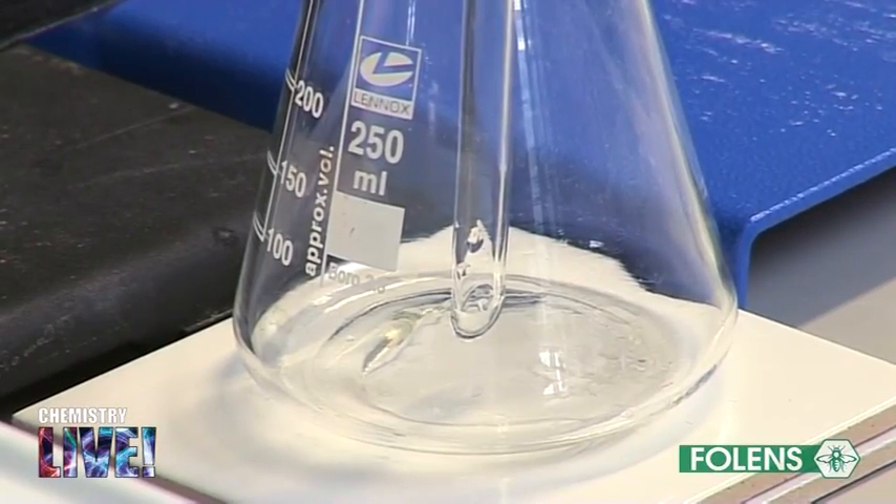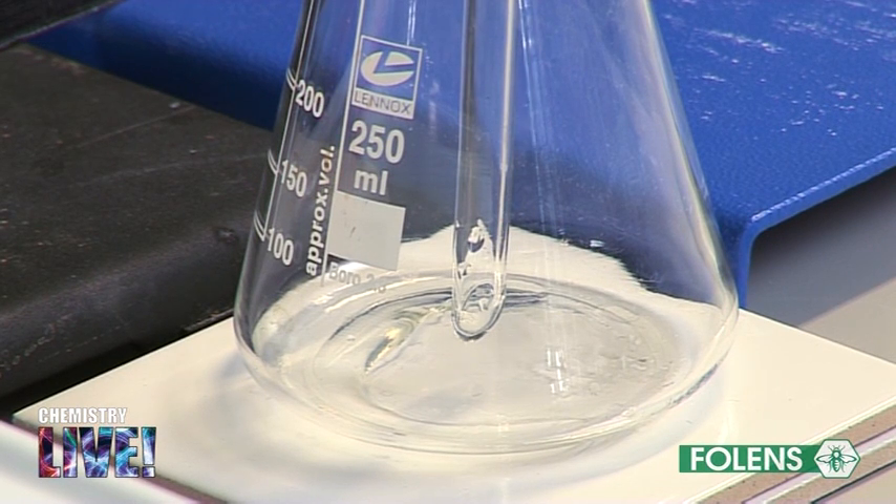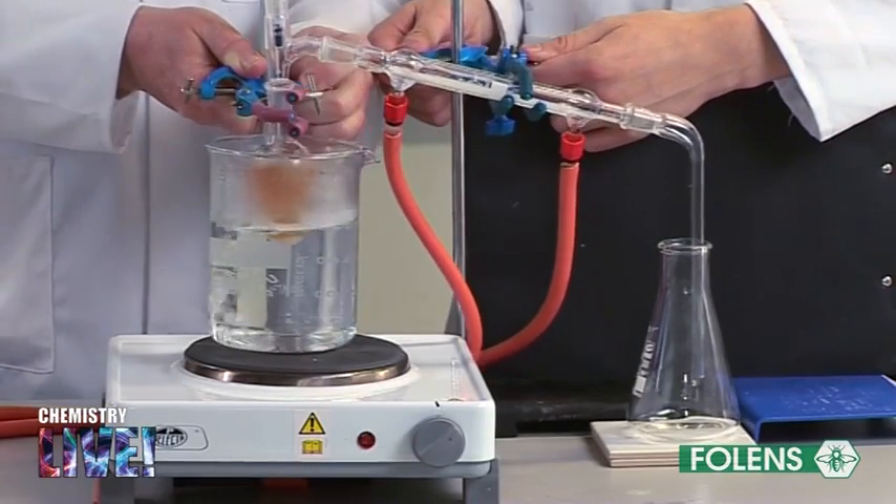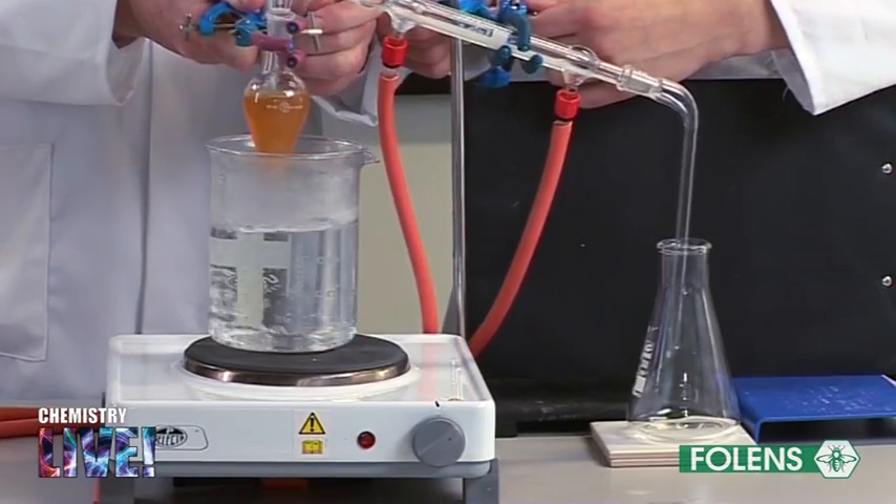Continue heating until about 20 cm³ of ethanol has been collected. Allow the apparatus to cool for a few minutes.